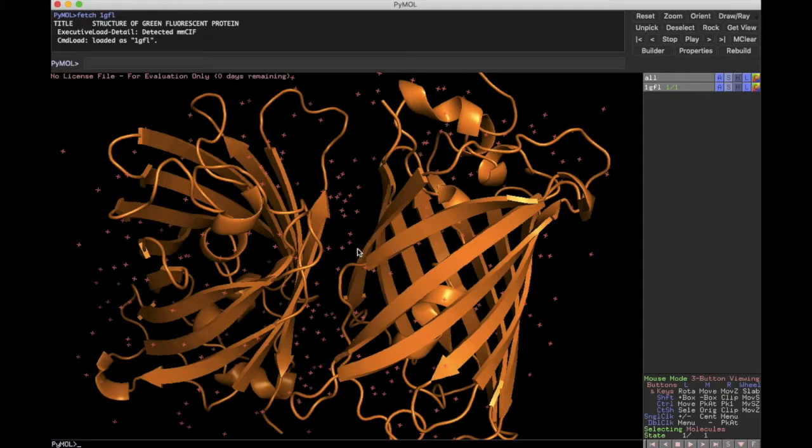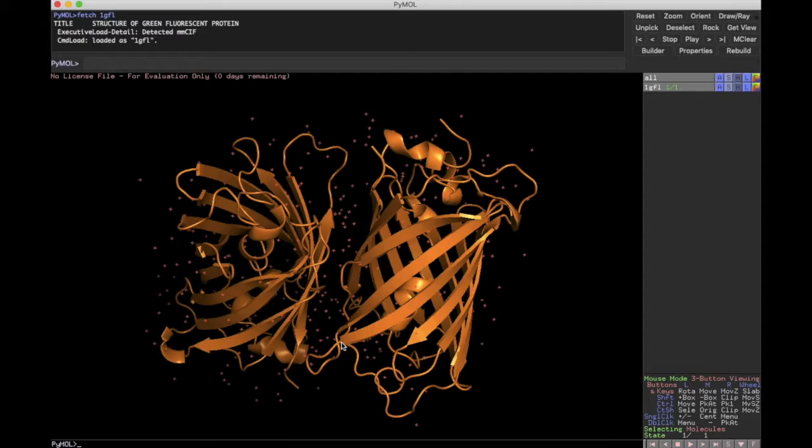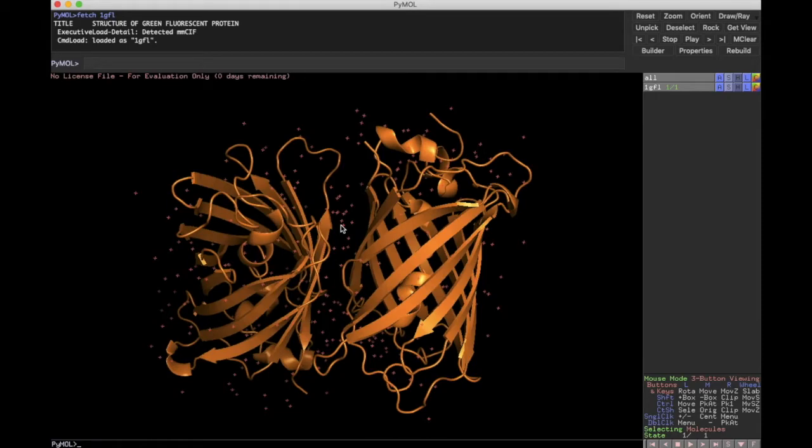Bump, bind, burst, and bump, right? There are these water molecules that are zipping around, solvating, binding to the outside of these proteins, for example, so that they can move around and interact with different things, okay? And so that's what these little stars are. They're solvent, and they're most likely water molecules that remained in the crystal structure. They could also be salt molecules, but we can investigate that further a little bit later.